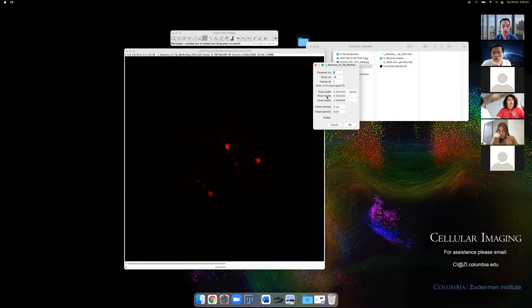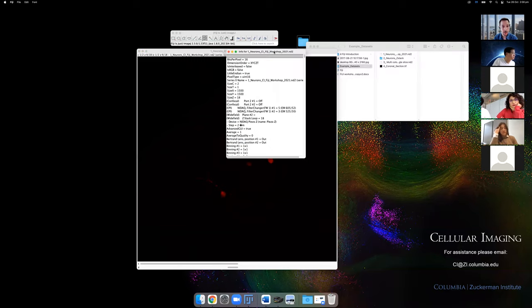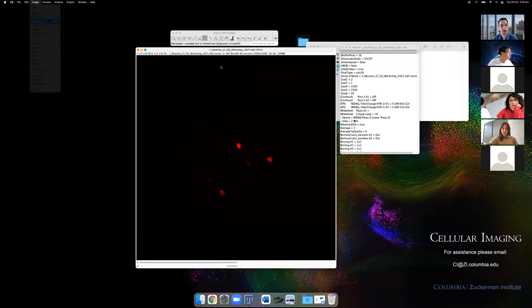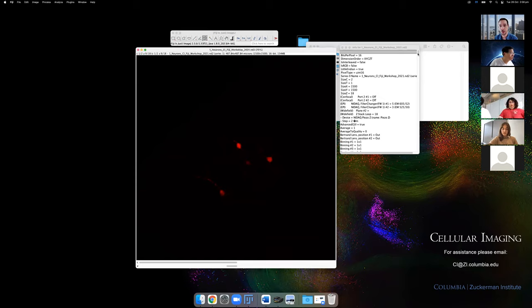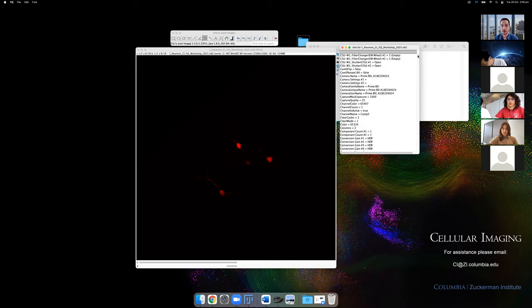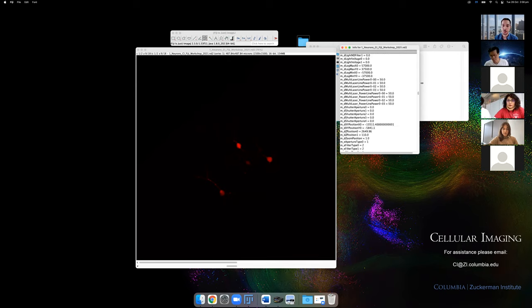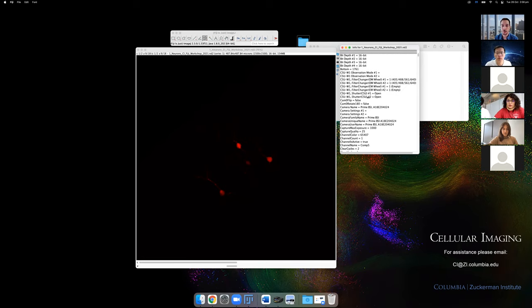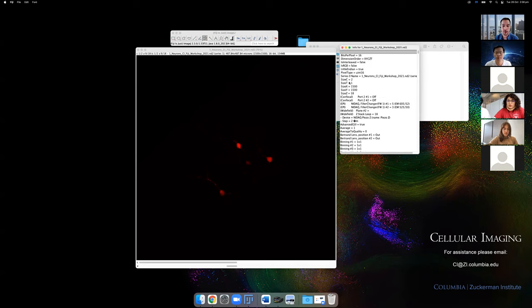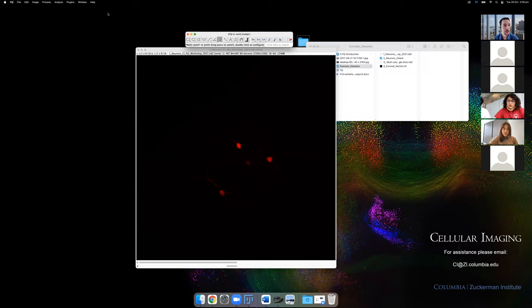Even if you've been working with data for a while, make sure the properties are still correct. You can also press 'I' to show the image information — sometimes companies don't put scaling information in a way that goes into Properties, but it will be in this info panel. All the acquisition details like exposure times and laser powers will be here, which is really useful years later when you're trying to recall what happened with an experiment.